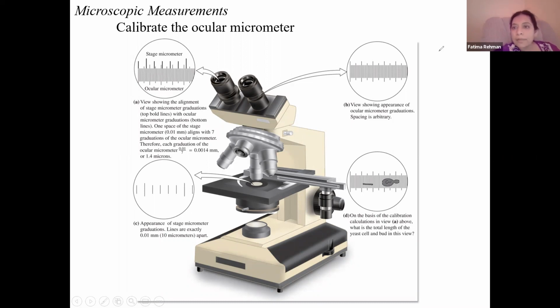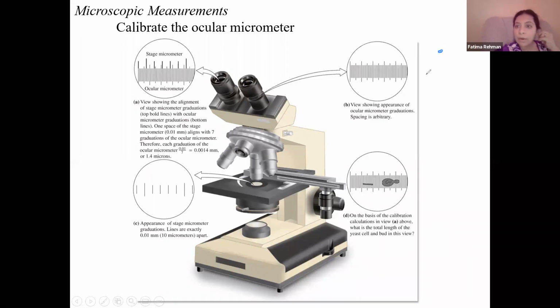Let's say I have a little cell and I'm looking at it under the 4x objective lens, and I see some dots and a bunch of them around it. So I know that that's my cell. I move over to the 10x objective lens and I can see a little more detail, maybe a tiny nucleus inside. And I'm like, oh yeah, it looks like an animal cell.